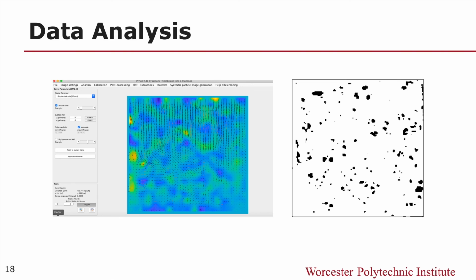From here, we use PIV on MATLAB to create a strain distribution curve over the course of the 7 days, and in the images above you can see the speckle pattern of the collagen gel and the strain rate color map based on the velocity field for day 1 of stretching.